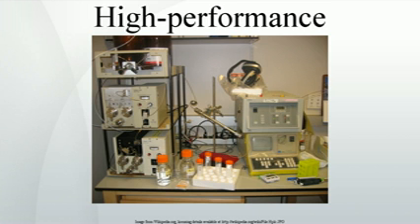Trifluoroacetic acid is used infrequently in mass spectrometry applications due to its persistence in the detector and solvent delivery system, but can be effective in improving retention of analytes such as carboxylic acids in applications utilizing other detectors, as it is a fairly strong organic acid. The effects of acids and buffers vary by application but generally improve chromatographic resolution.